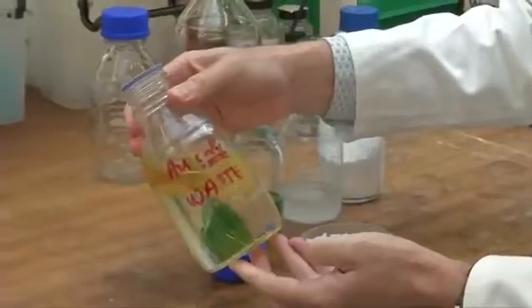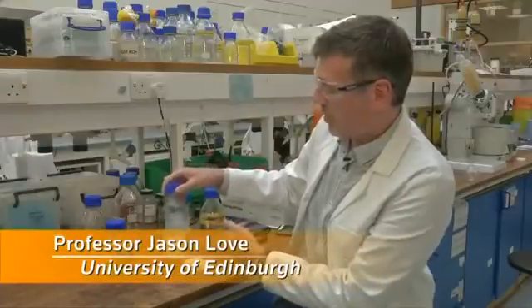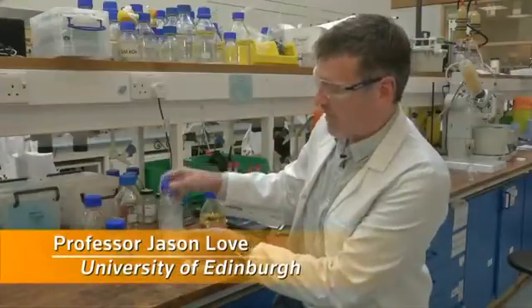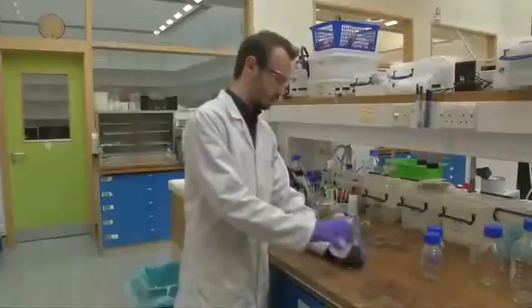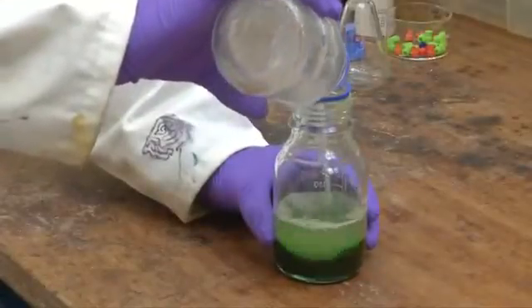Professor Jason Love's team has developed a compound that does the job simply and cleanly. We have our nice white compound dissolved in that organic solvent, and then you can mix that organic solvent with the metals that you dissolve in water or in acid.